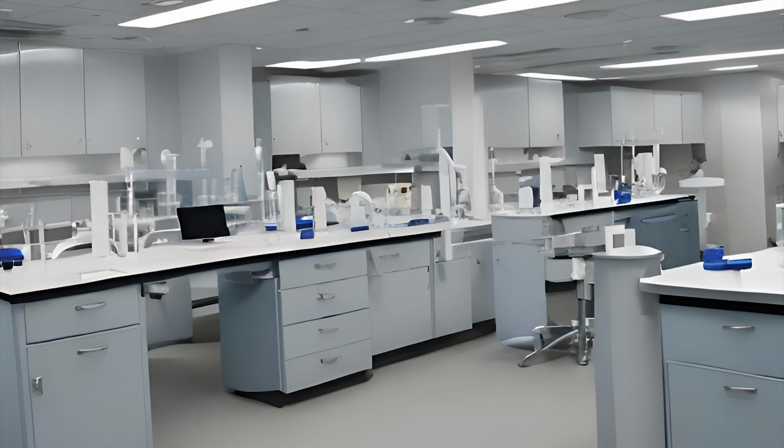Because of that, a lot of locations and teams will like to bring things down in a batch. They might collect a whole bucket of samples and bring them down at the end of the shift. Sometimes that's okay. Oftentimes that's not, and it depends on the work that needs to be done.